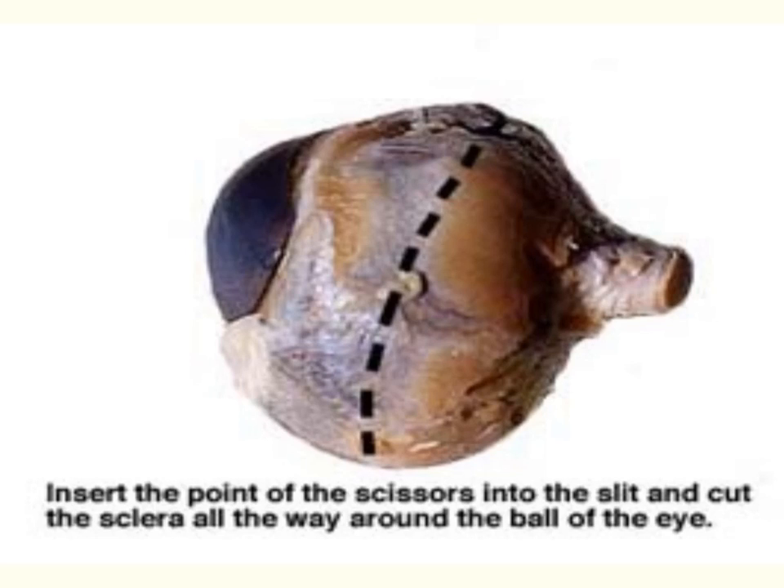When you're ready to do your dissection, you want a sharp scalpel blade. We're going to situate the eye and cut through to separate it into an anterior and posterior section. The eye is very much like a cherry tomato — if you cut it too quickly, the fluid inside will squirt all over your face. So take your time and make small incisions until you nick the inside of the eye and release the pressure; once you've done that it will no longer squirt.